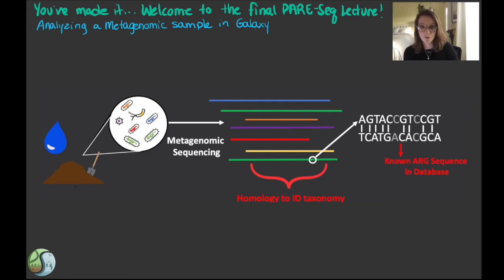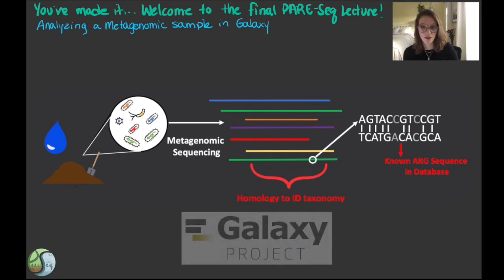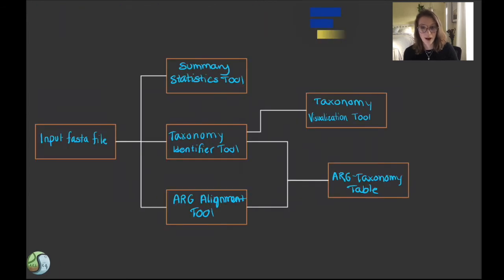To do this, we'll use bioinformatics. Specifically, we'll use the Galaxy platform to analyze files generated from nanopore long-read sequencing, as we've discussed in the previous video. Then we'll talk through analyzing all the cool data the bioinformatics programs have compiled.